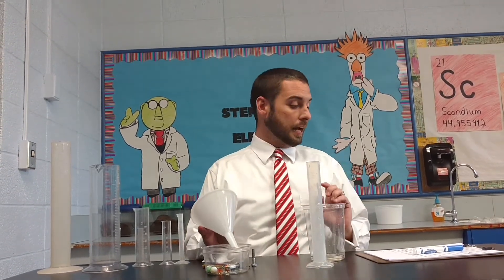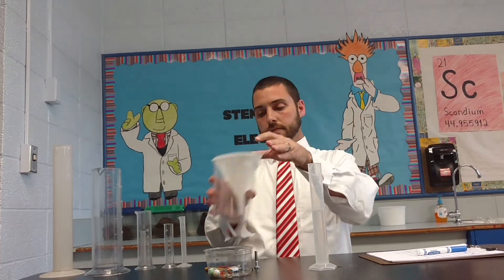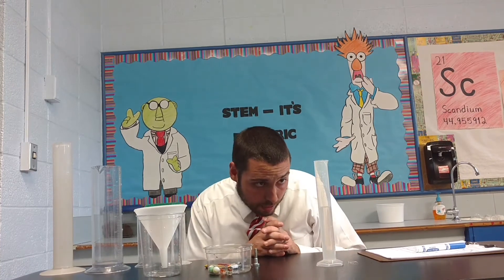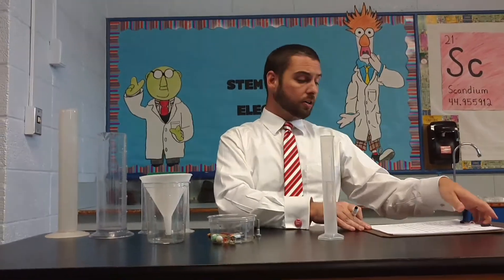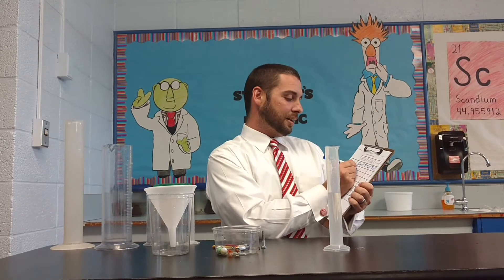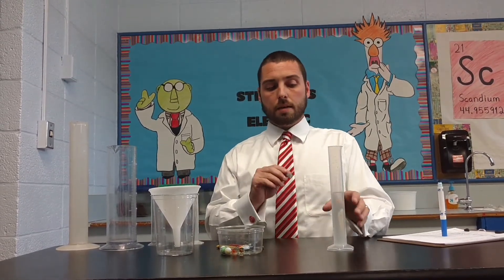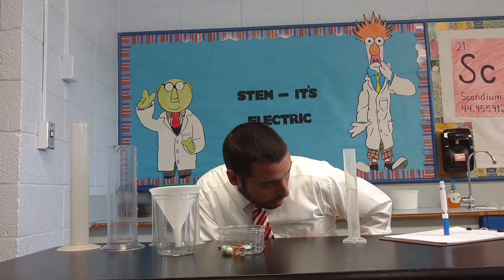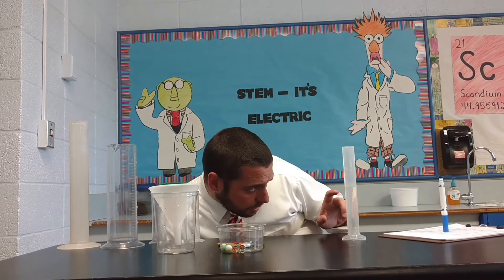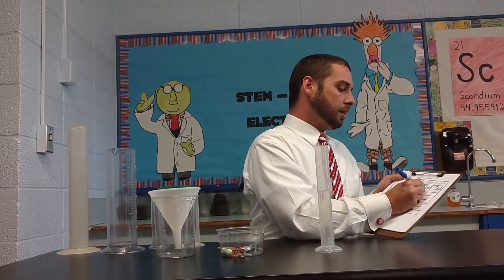It's exciting for us to teach you folks. I put my water back in and re-examine. There was a little bit of water that dripped out, so my water level prior to displacement is no longer 70 milliliters — it is 69 milliliters. I need to record that. Now it's time to slip my bolt into my graduated cylinder. Slip it on in — boop. Now we check: where is the water level? We started at 69, and now it looks like it went up to 70, 71 milliliters. I'll record 71 milliliters.